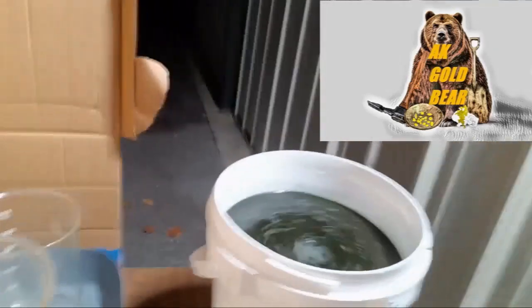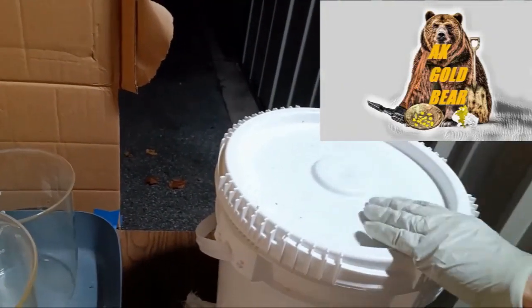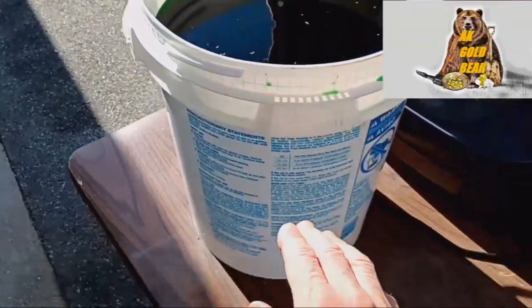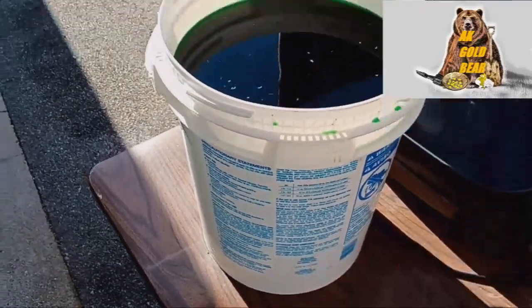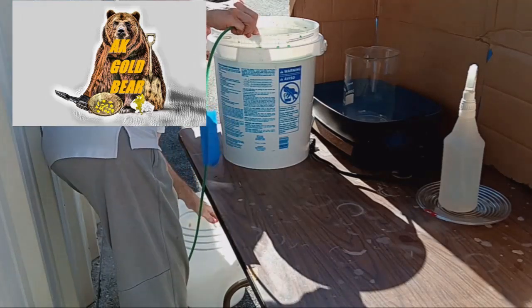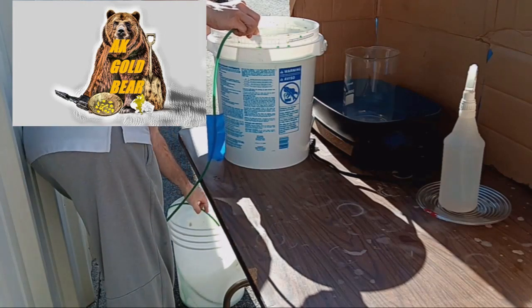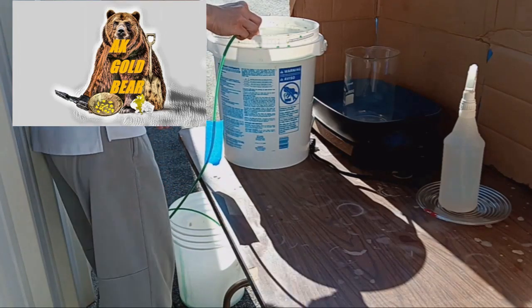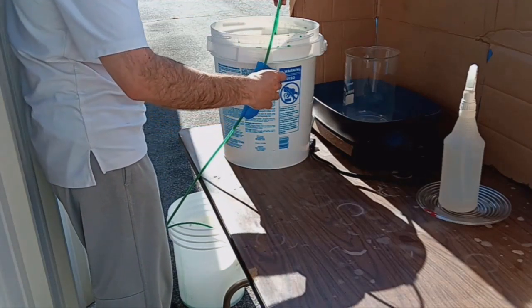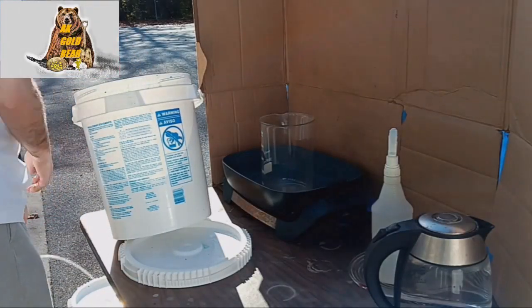Now I will leave the solution to precipitate the gold from it until tomorrow. Next day, and now all gold from this solution should be on the bottom. I need to carefully, slowly drain the empty solution. Done, ready.